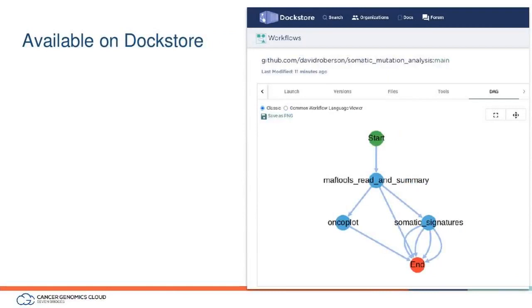This particular tool that I customized is not in the public apps gallery. It's on Dockstore, which I had mentioned. Dockstore is another great place to find workflows. It has a lot of tools that are also in the Common Workflow Language, and I'll show you how to do that. But we recommend any of our researchers, once you're done customizing your workflow, or if you wrapped a new tool, go ahead and share it with the greater community via Dockstore.